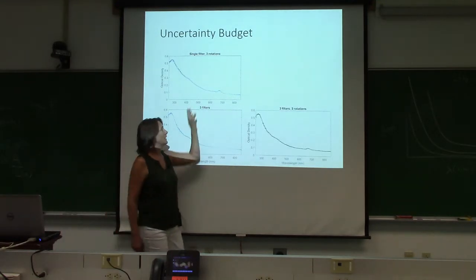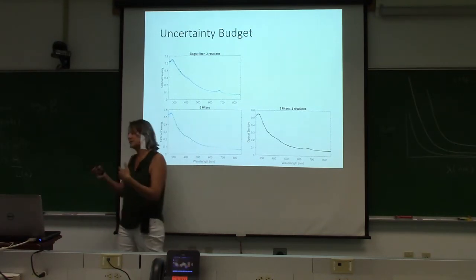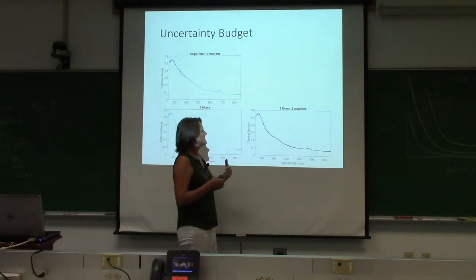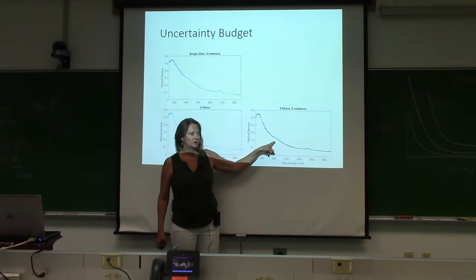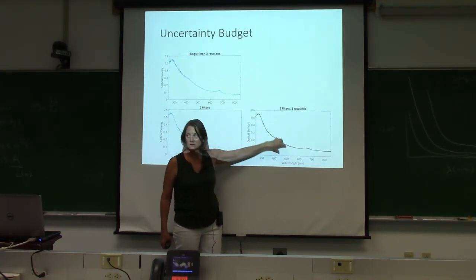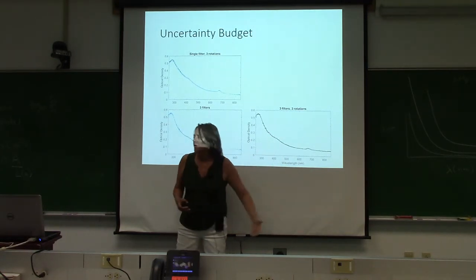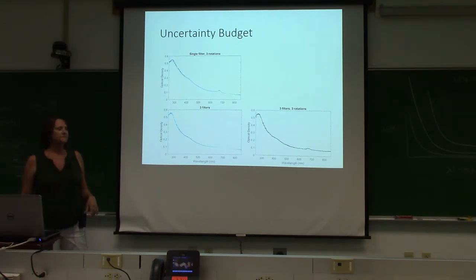Here's the uncertainty when you put all of those uncertainties together and you calculate the sum of the square error, and you do all of your propagation of error, and that's what you get. So this is what you're aiming for. Then you would put the uncertainty of your blank filter pad on top of that, the uncertainty of your filter volume, and you would add all of those up, and that's how you should be presenting your absorption. Okay. Yeah.